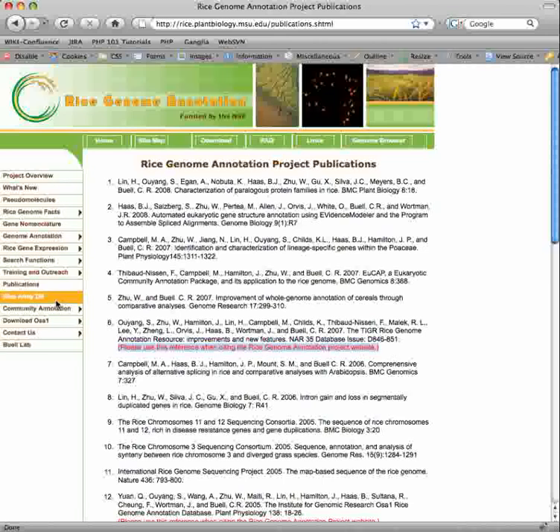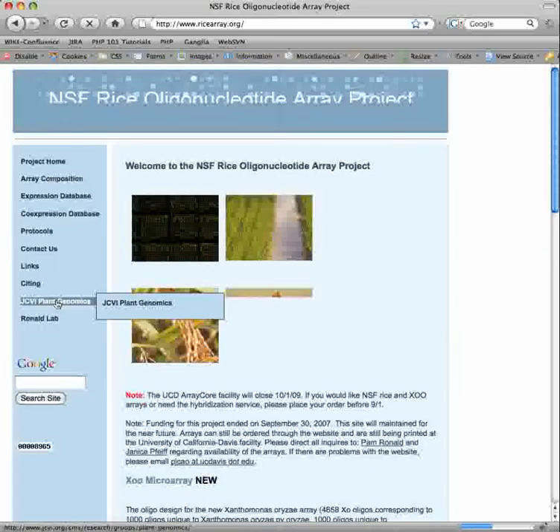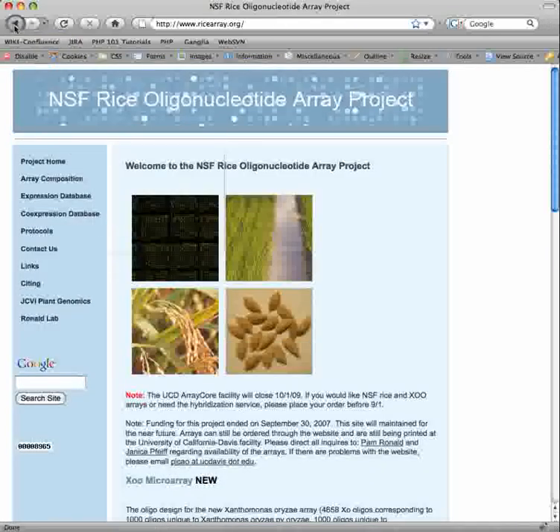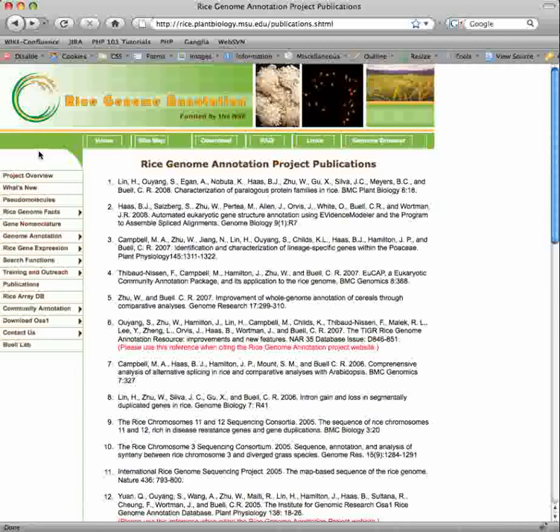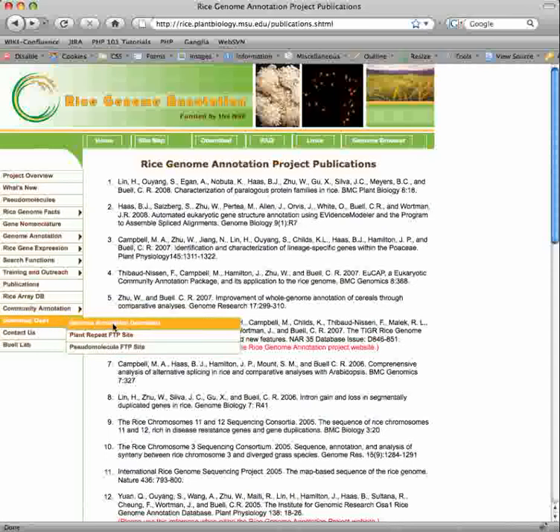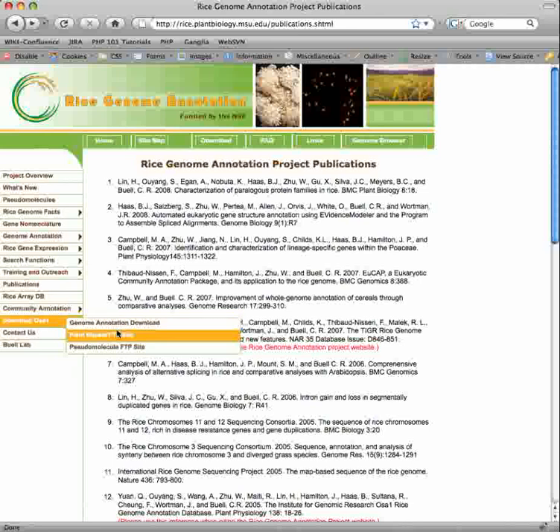The rice array database takes you to a separate website. The community annotation page is discussed further in a separate tutorial. You can download the annotation, repeat sequence, and pseudomolecules from our download sites.